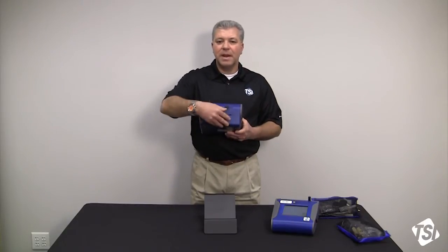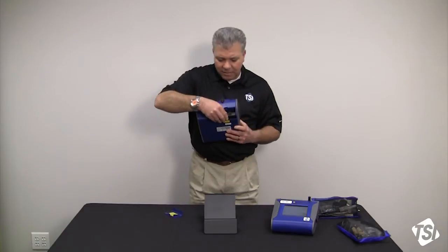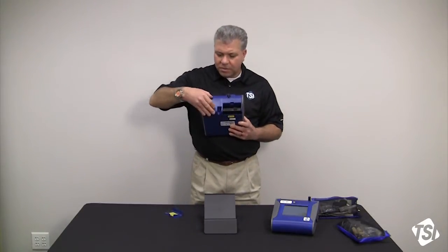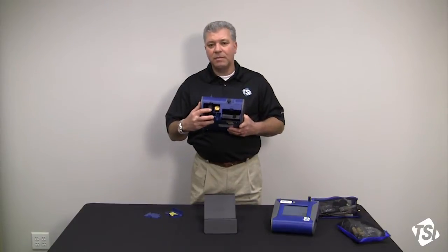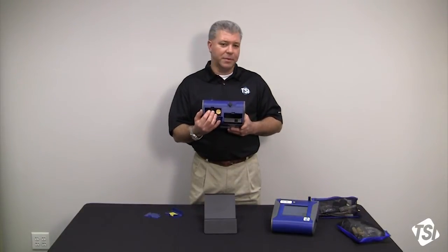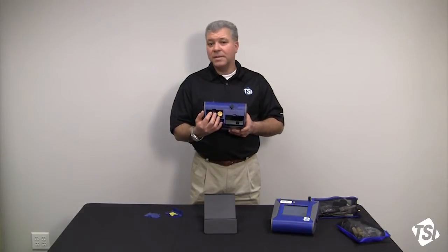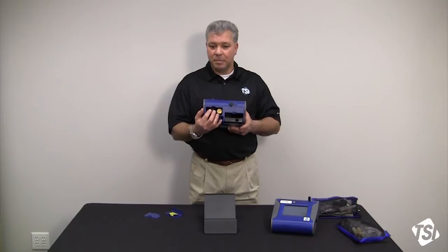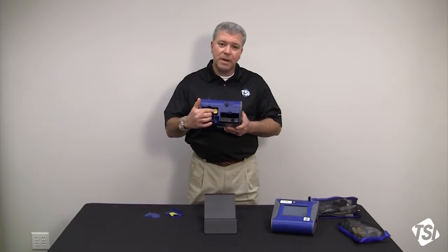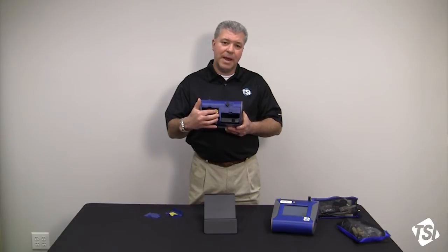On the back side of the instrument you've got a battery and battery cover door, and you also have a filter cover door. Inside the filter cover door you've got a 37 millimeter filter cassette that has an 80 micron sieve filter — this is not a gravimetric sampling setup, just so everybody knows. Also over here is the HEPA sheath air filter, and that's removed by a spanner tool.